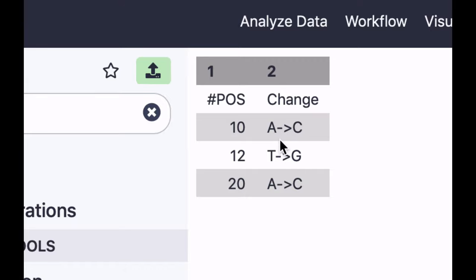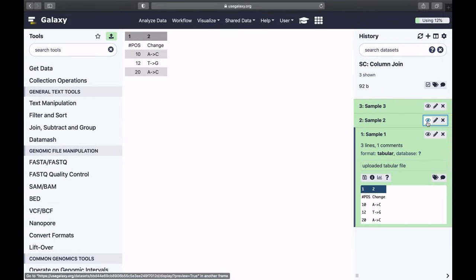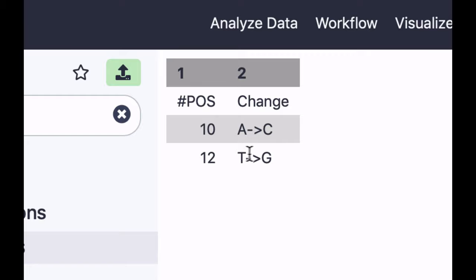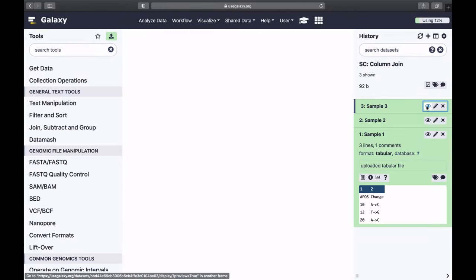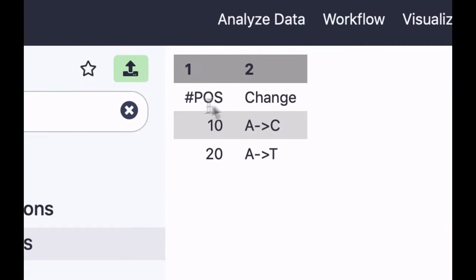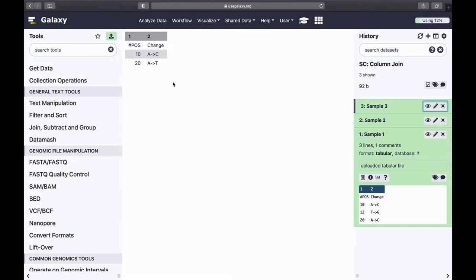So in sample one you have these changes. In sample two you have something like that, and in sample three you have those. And suppose you want to merge all of this into a single table and use position as a common field, a hinge if you wish to hook all the data on. Let's see how this works.